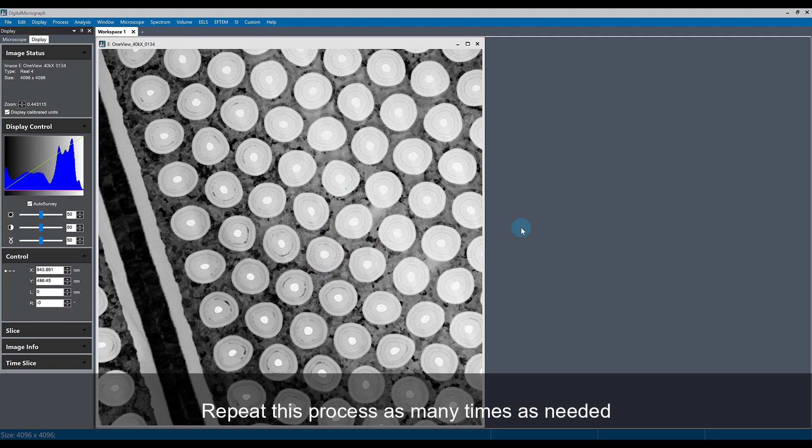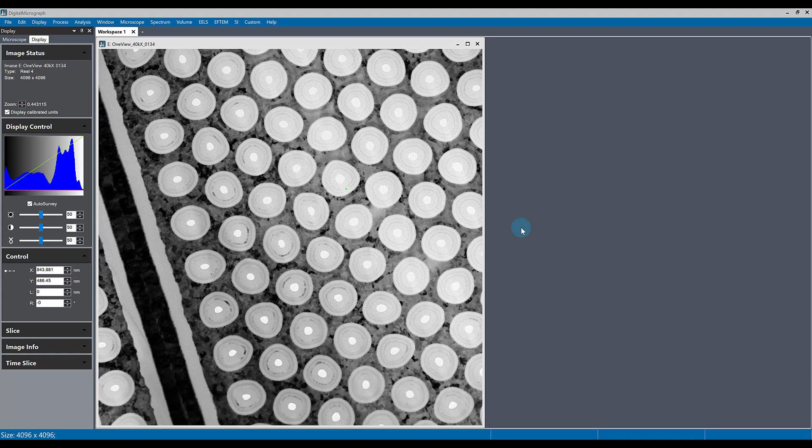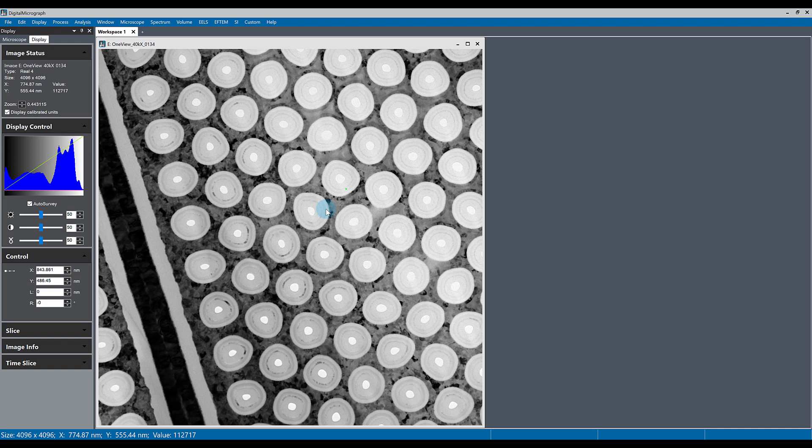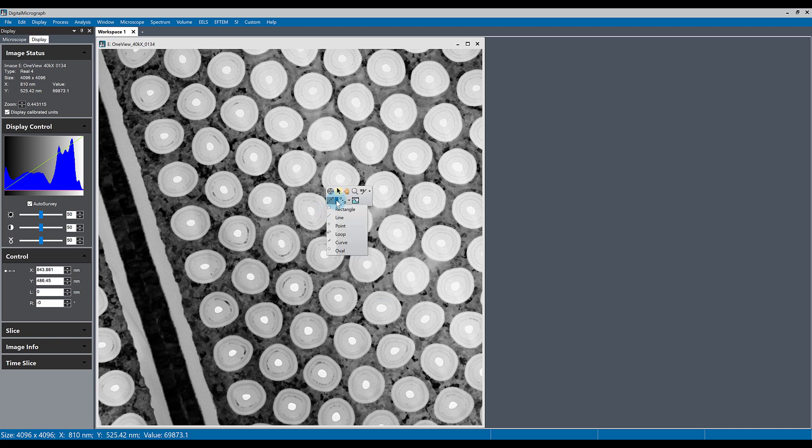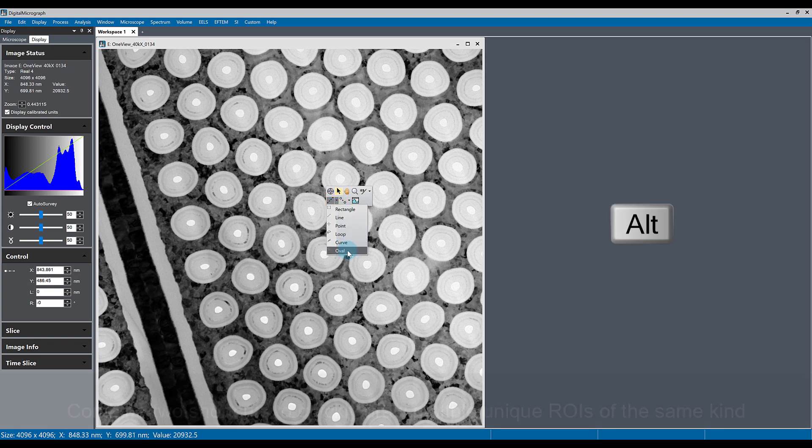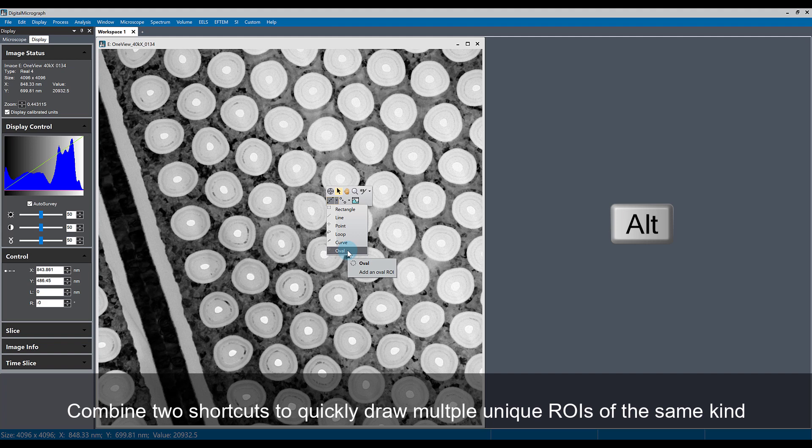The last ROI tip is that you can use the alt key and the shift key in combination to make a sticky type ROI of any kind and draw multiple types of ROI. For example, if I go to the ROI menu in the right-click floating menu and select the oval ROI while holding the alt key, I now have a sticky ROI.